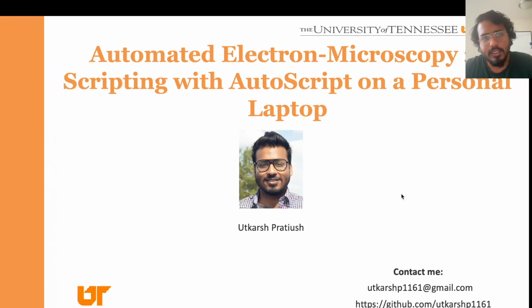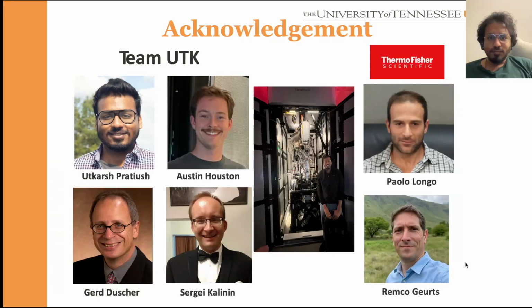Hi everyone, welcome to the second tutorial for automated electron microscopy. In this tutorial we'll cover how you can script with AutoScript on a personal laptop. In the last tutorial I showed you how you can install it on your desktop PC and do scripting from there, but today it's very handy when you can also script from your personal laptop, write some code beforehand, and go on the microscope and try that, right?